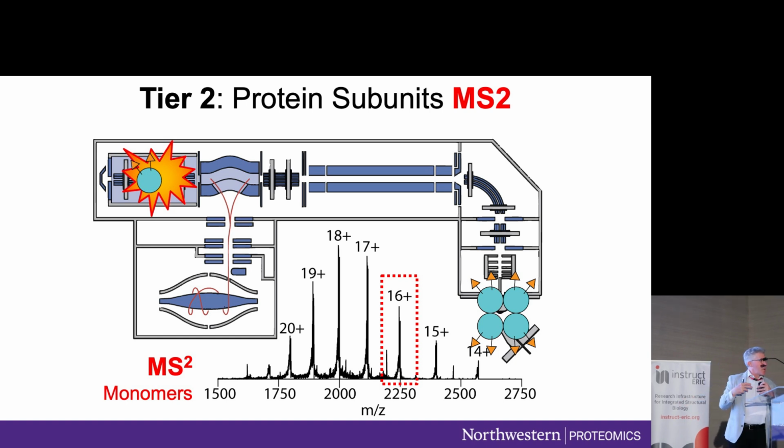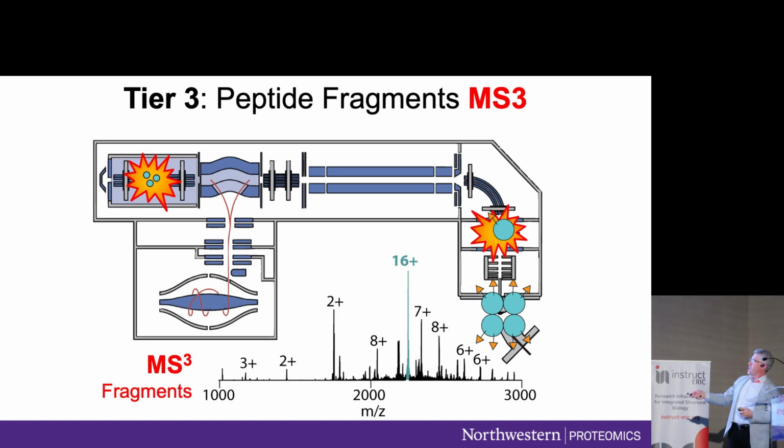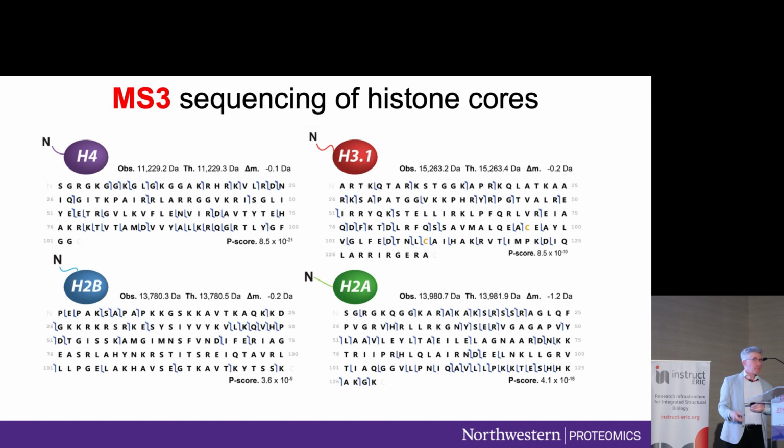So it stole a bunch of protons, which is great if you're going to then take the subunit and further bash it apart. So here's my subunit, and now I'm going to fragment it into these terminal pieces in top-down mass spectrometry. So there's the fingerprint. There's the data that we use to partially sequence proteoforms. Those are the blue flags. Those fingerprint pieces, each little line on the fingerprint is one of these blue flags. And I could go into more in the Q&A, but that's probably enough for how this works.